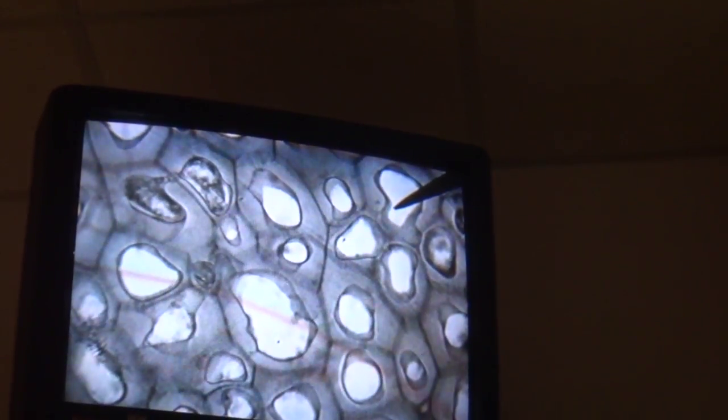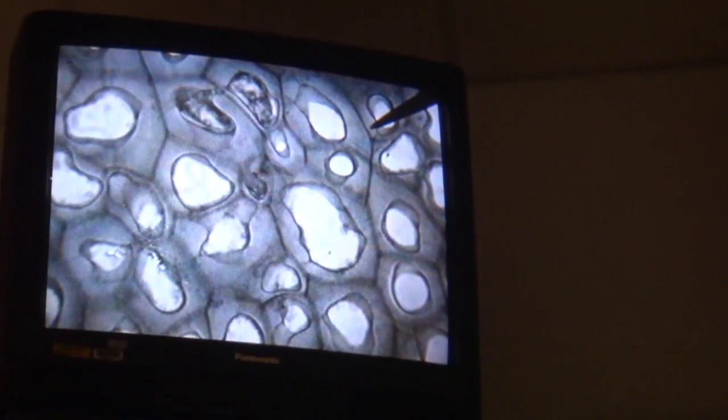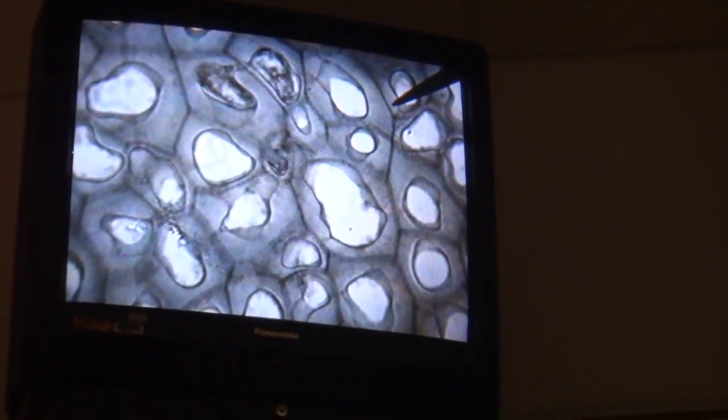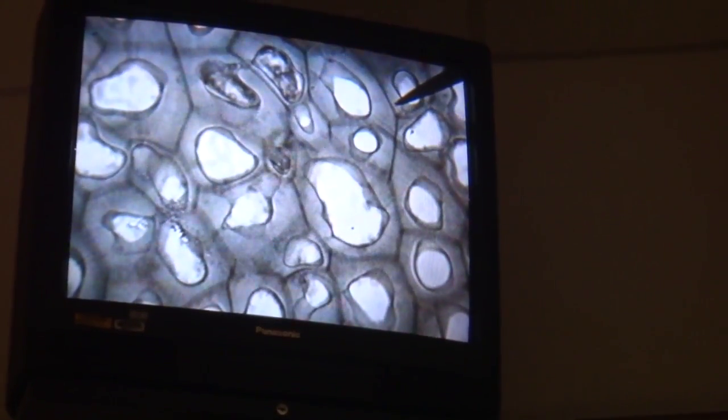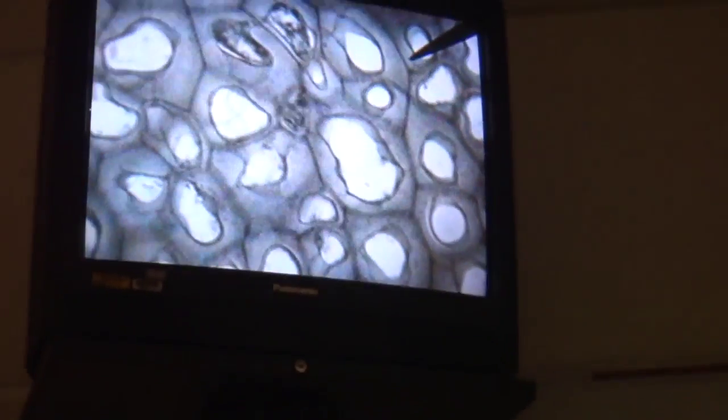Well, through the middle lamella, and the middle lamella is right there, okay? But they run through little holes in these very thick lignified walls. They're called canaliculi. And I don't think I'll ask you that, but just that first lab word, nobody gave me that. But you should have been picking up that because it did say it. So, anyway, okay. So sclerenchyma, and individual cells are called sclereids. Okay.